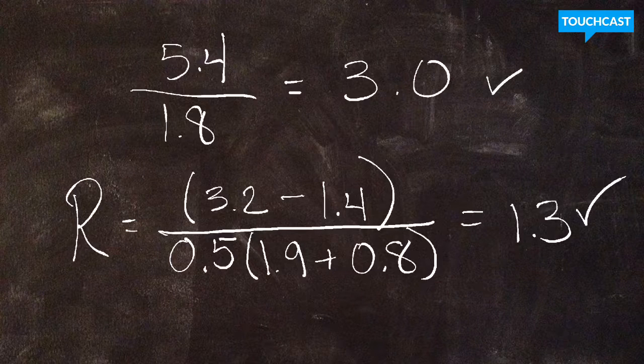All right, everyone, I really hope this has helped you out quite a bit. Please take this lab as just understanding that we're trying to effectively separate solutions, and all of this data that you just did is a measurement of the effectiveness of the separation.